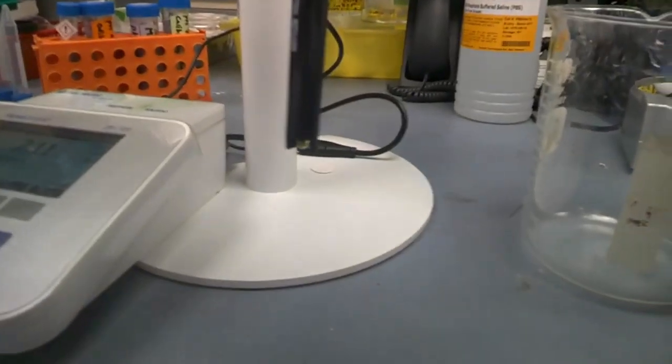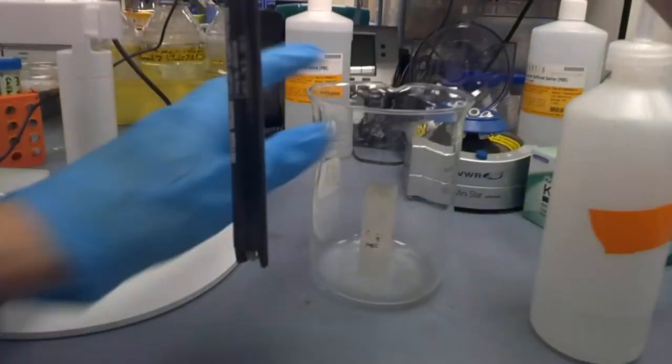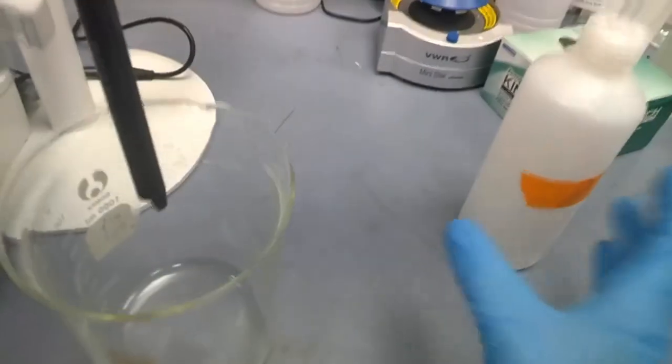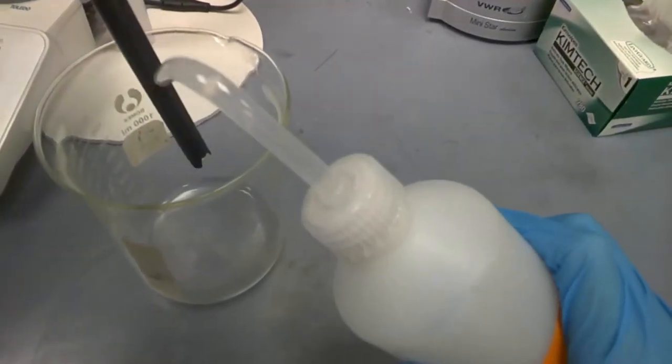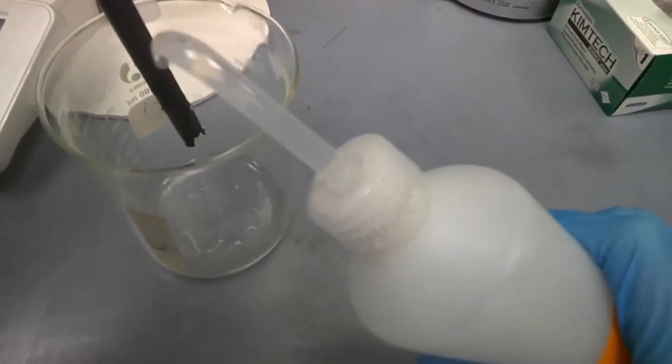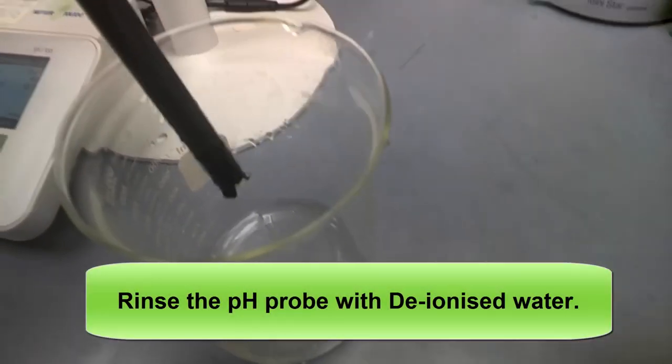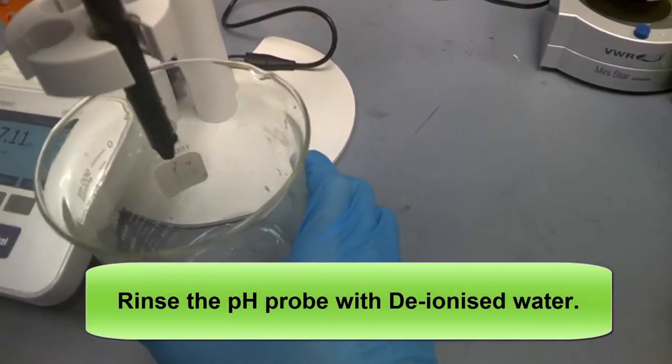Place on one side this part here, the pH probe. We wash it first with DI water. Spray some DI water at the probe here. Then put it back at the casing.